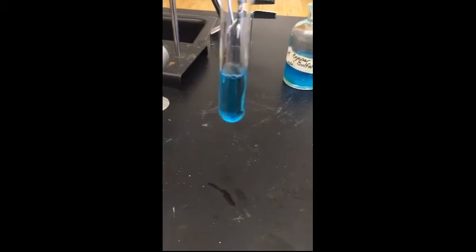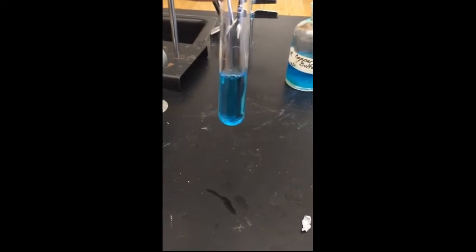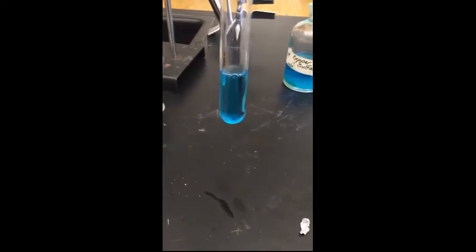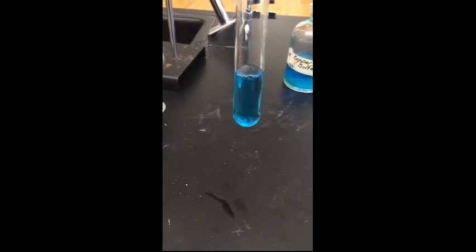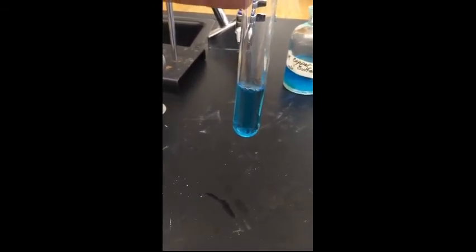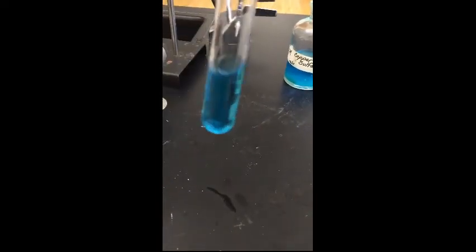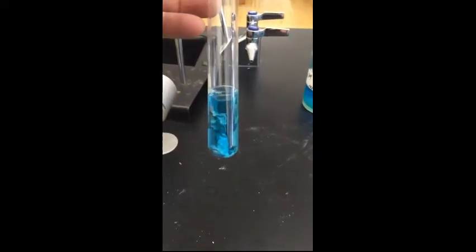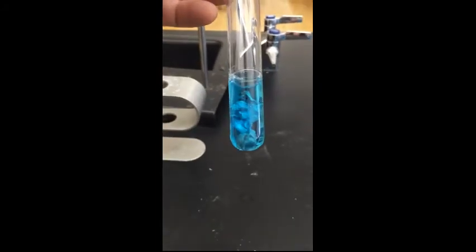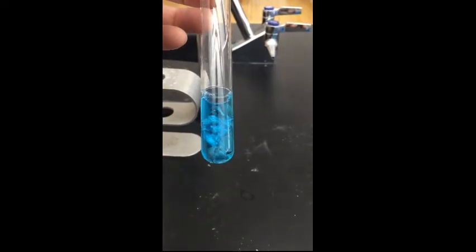And then I'm going to take another chunk of zinc called mossy zinc, and I'm going to put the zinc right in the test tube, but I'm not going to put this piece in because it's too wide. Let's try this. Okay, so you saw the zinc beforehand. Basically, we're going to let that go for a little bit. You might be able to see it change right before your eyes. Let's see.